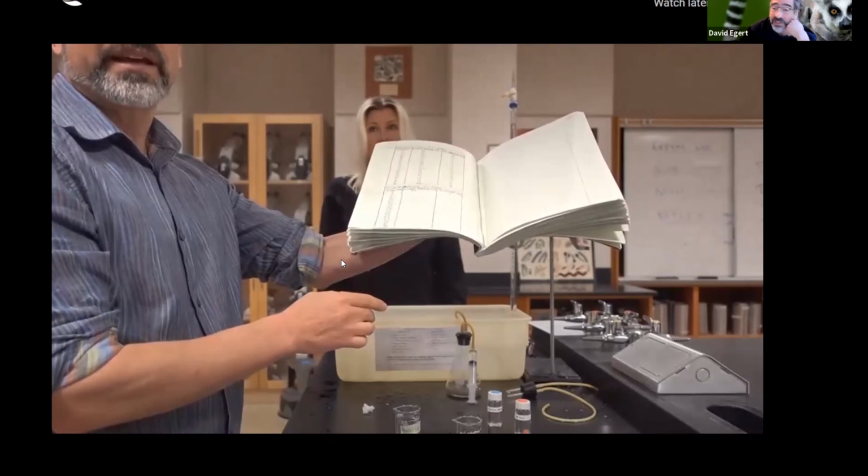And for every mil of oxygen that goes up, it's going to push the water down a little bit. So the thing you're measuring is the mils of water, but you're going to have to do that simple math. If there's 50 mils of water, there's 0 oxygen. If there's only 45 mils of water, that means 5 mils of oxygen have gotten in there to displace it. So that's something you're going to have to actually do.